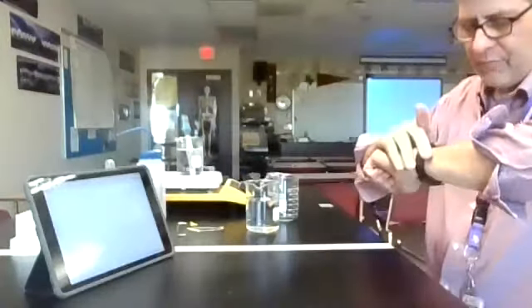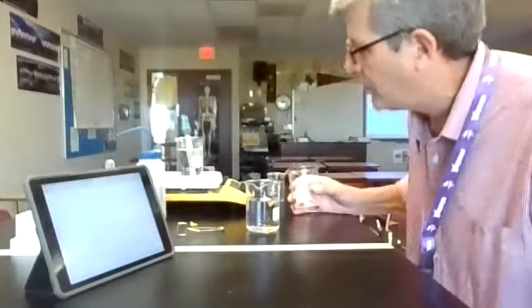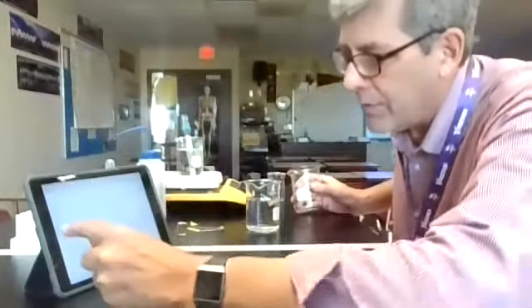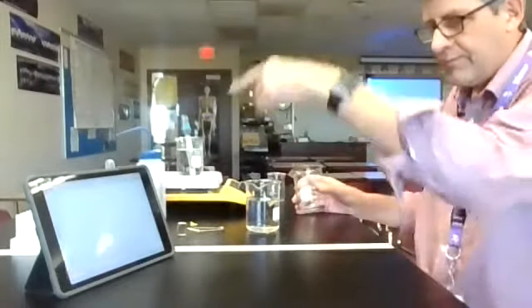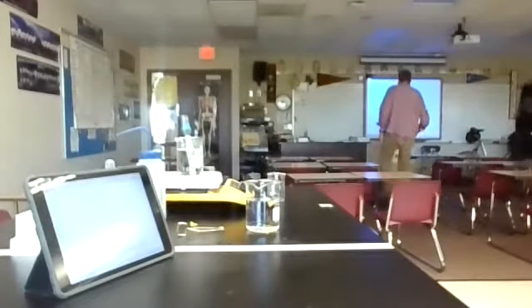It's only been heating for a minute and a half or so. It usually takes 7 to 10 minutes to heat up to the temperature necessary to melt this through. What you're going to see is this is going to jump up. This is temperature versus time. All of a sudden, when this stuff is done, you're going to see a bit of a rise in that instead of this gradual one that we have. While that's going, I'm going to grab myself some ice, so you guys continue to watch the graph, see what's going on. I will be back momentarily.